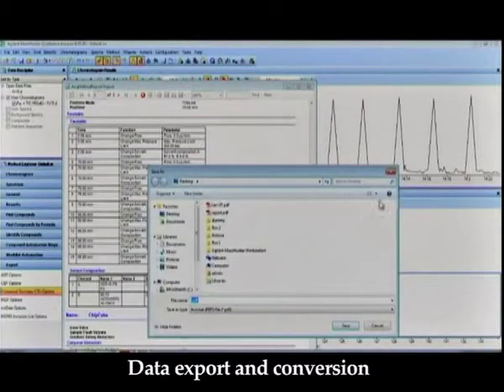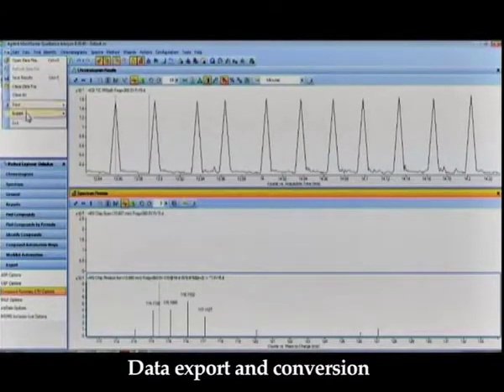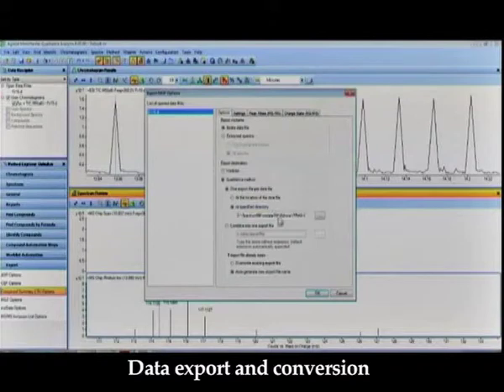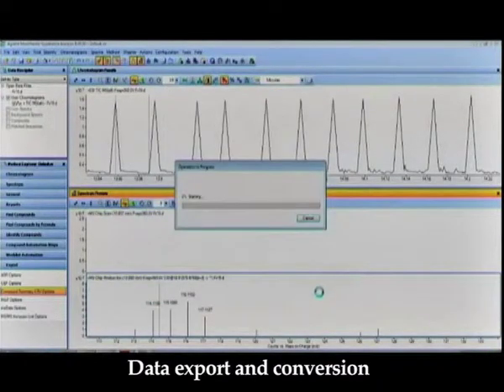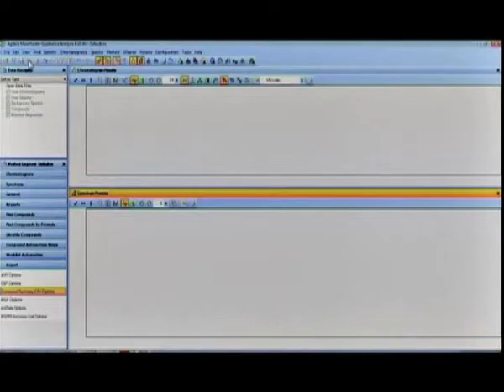Click on export and you can convert the mass spec data file, the .d file, into a Mascot generic file, .mgf file, which can be used for analysis using Mascot. Finally, we can close the file by clicking the folder icon given in the qualitative analysis window.